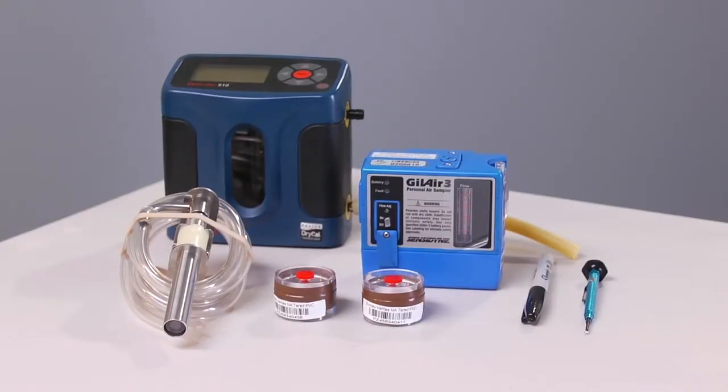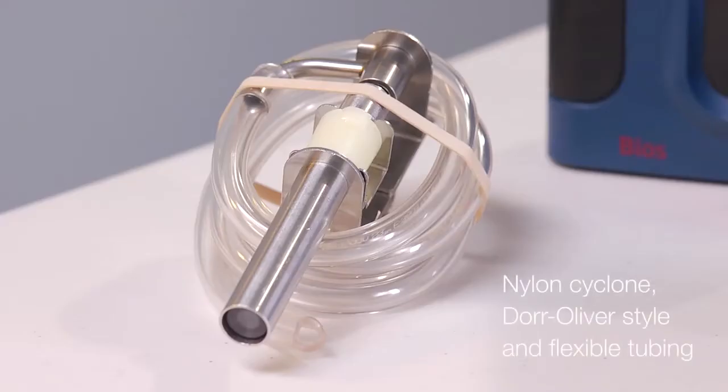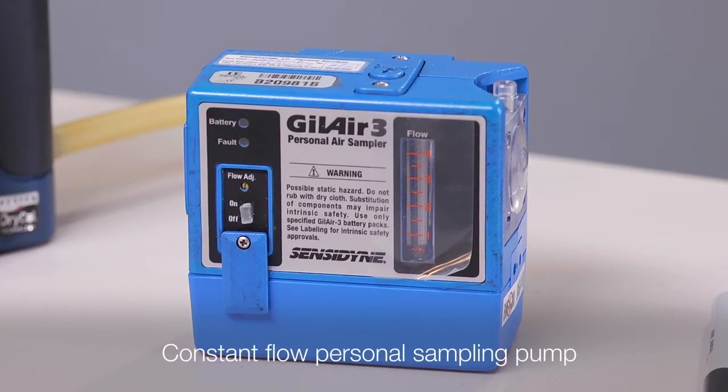You will need the following materials: a two-piece filter cassette — the laboratory can help you choose the appropriate filter type for your analysis. When handling the cassette, never obscure the barcode, especially for a pre-weighed filter. A nylon cyclone, Dorr-Oliver style with flexible tubing, and a constant flow personal sampling pump capable of the flow rate specified by the cyclone manufacturer.